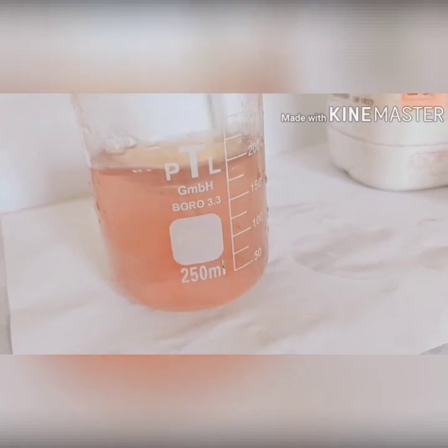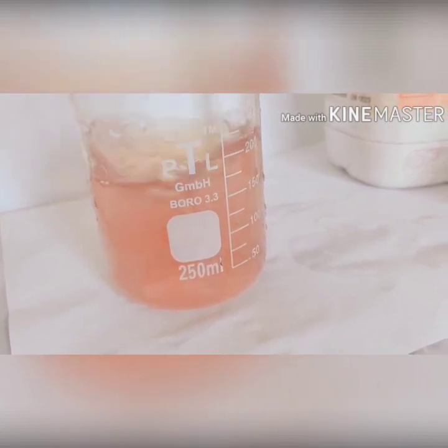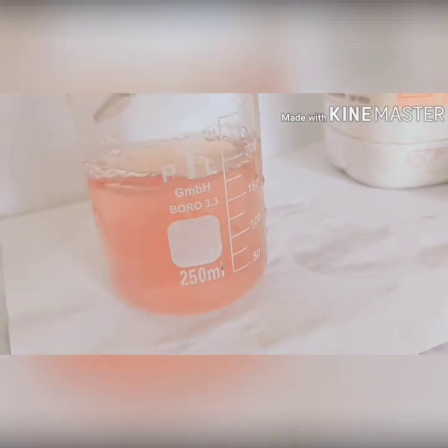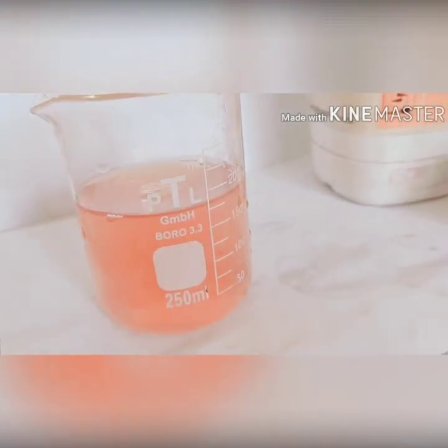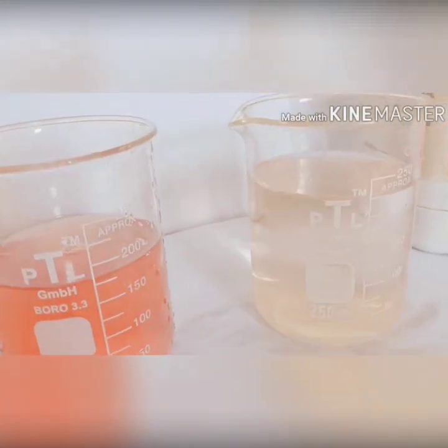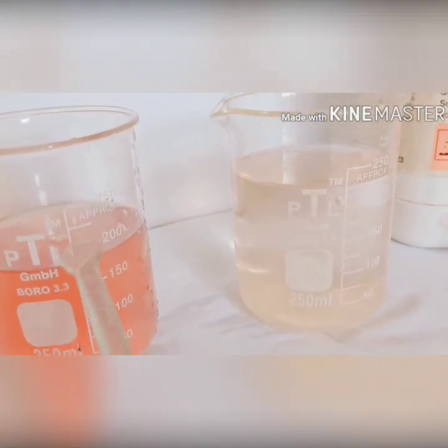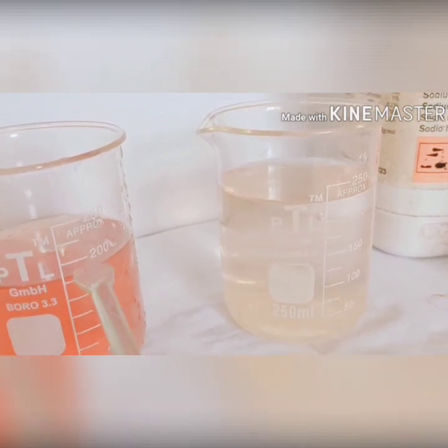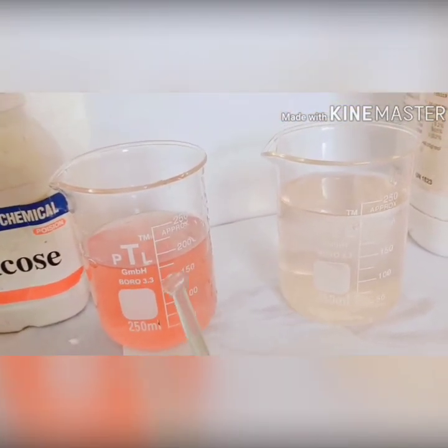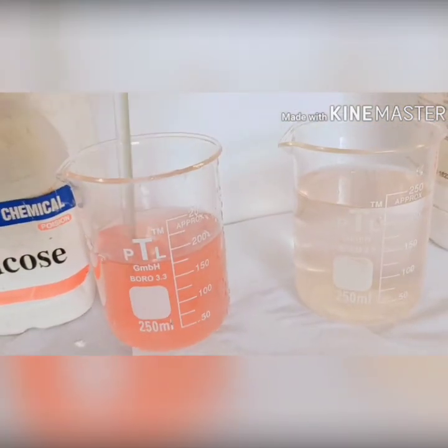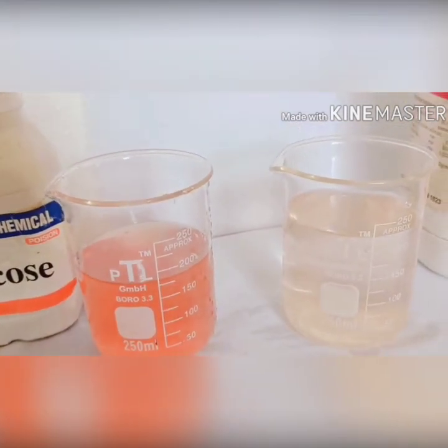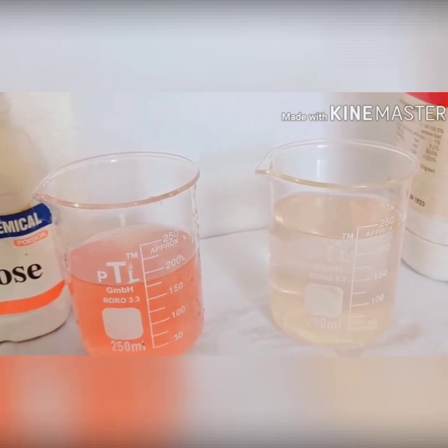The color changes continuously. If we want to change the color further, we stir it and let it settle. Now you can see that the white color of the manganese indicates that manganese has a positive two oxidation state. So we have two beakers: the first has brown or orange color, which indicates oxidation state positive four, and the light almost-white color indicates oxidation state positive two. This is the experiment — hope you like the video. If you like the video, tell me in the comment section. Thank you.